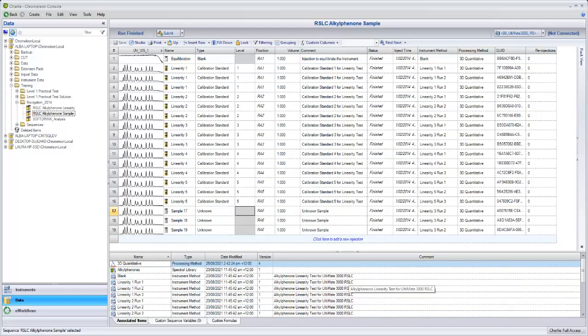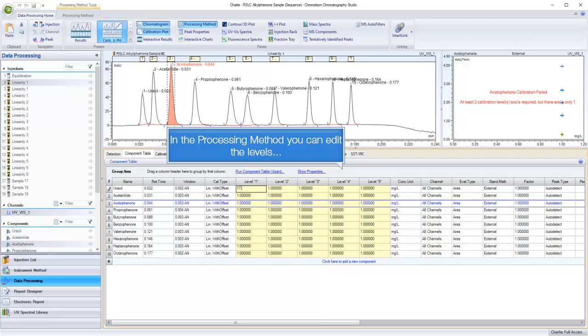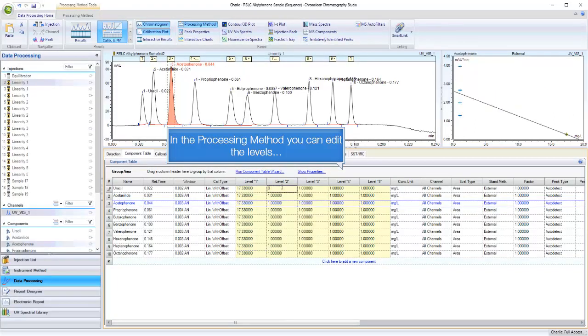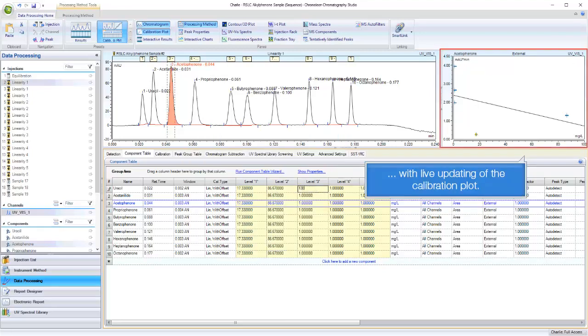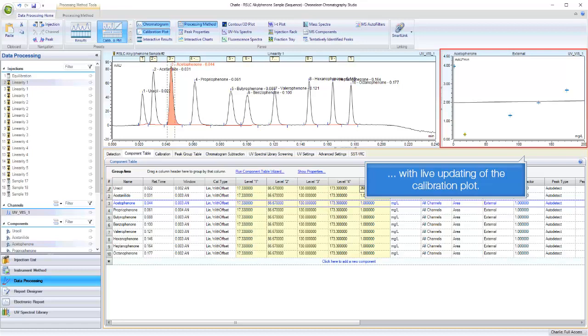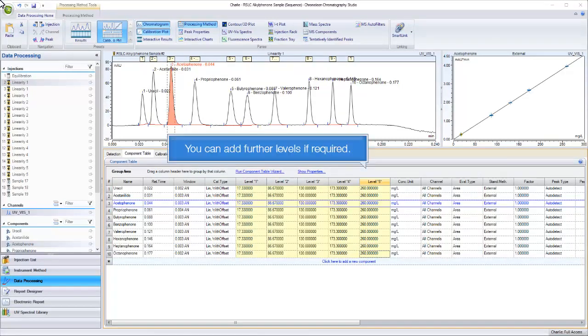Save the sequence changes. In the processing method you can edit the levels with live updating of the calibration plot. You can add further levels if required.